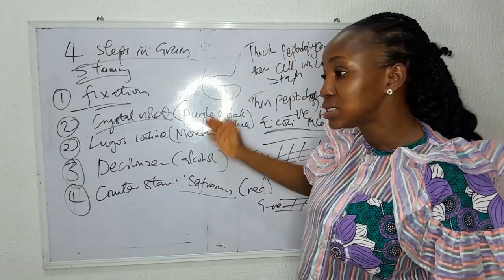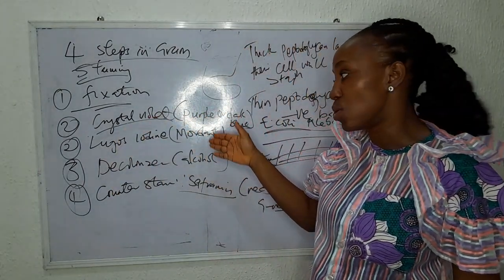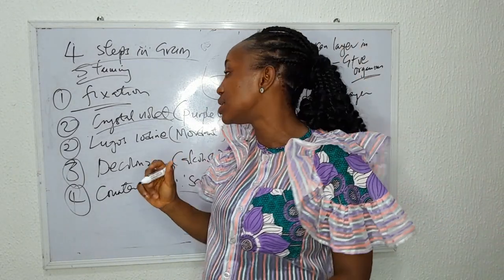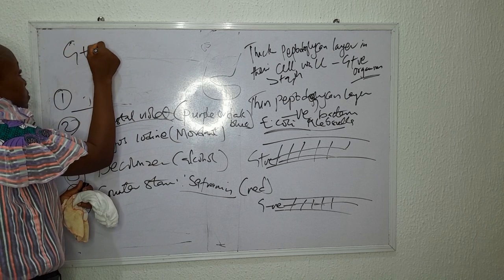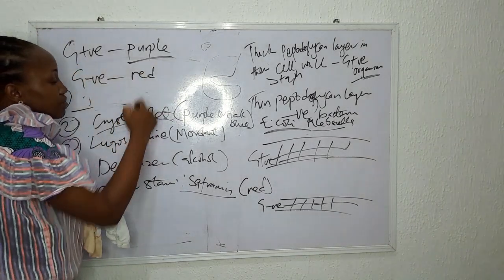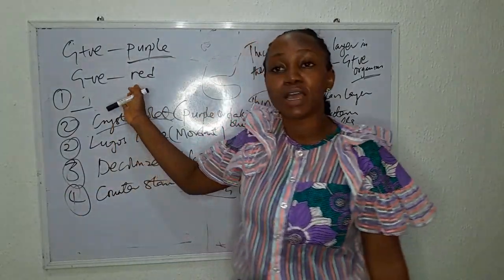But if you repeat these steps for a gram-negative organism, it's going to lose the crystal violet stain because the peptidoglycan layer is thin and it cannot stay when you decolorize it. So the gram-negative organism is going to retain the counter stain, which is safranin. So our final result when you carry out a gram stain, let's clean this, you're going to have the gram-positive organism purple, retaining the crystal violet stain, and the gram-negative organism red, retaining the safranin stain. Do we understand? Yes. So these are the basic steps that we do in gram staining, and this should be our final results.